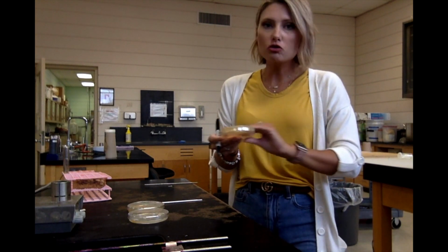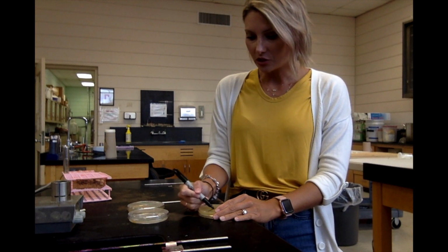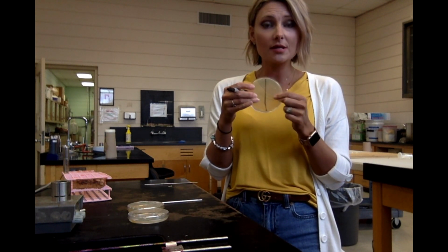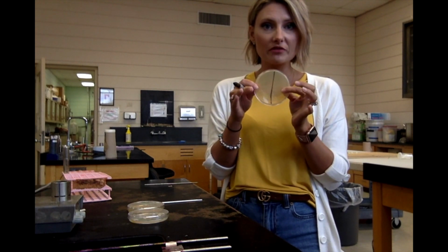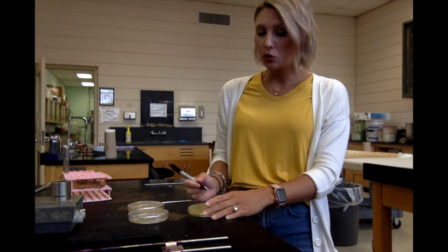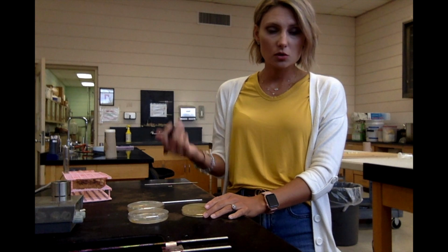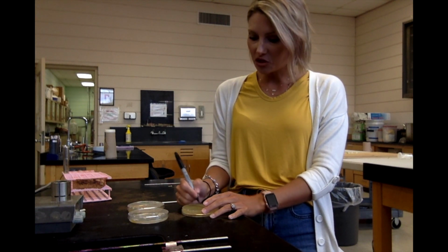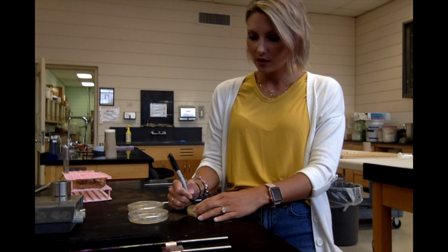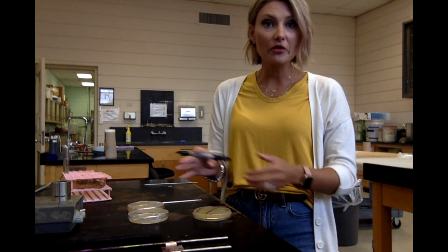So I'm going to draw a line straight down the center, not a very straight line, splitting my plate up into two different sides because I'm going to swab two different places. It's just going to help guide me. And then I am going to label what I decide to swab. So I'm going to do the bottom of my shoe, and then I'm going to do the water fountain. And then I'm going to put my initials. You always want to put your initials on it so that you know that it is yours.